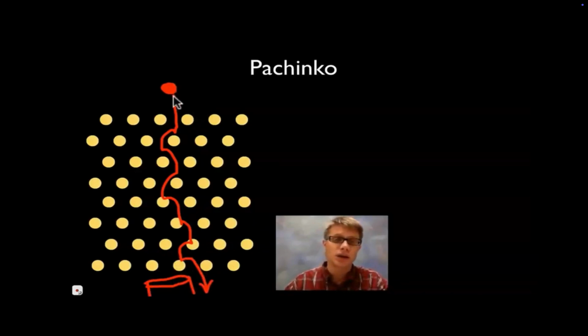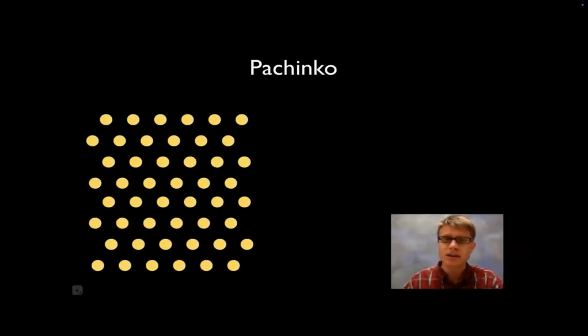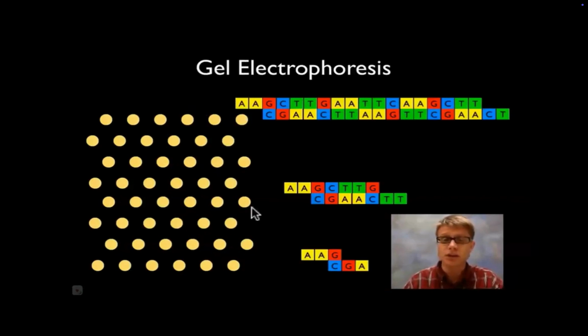But in that case, it wouldn't. So imagine a game of pachinko where we had one ball like this that's bouncing its way down. And then we had, instead of another ball, like 8 balls that are attached together. So what would happen to them if we dropped them in a pachinko machine? Does it make sense that they're sometimes going to go slower, they're going to wrap around, it's going to take them way longer to get down to the bottom. And so the single pachinko ball would already be at the bottom where this big chain of pachinko balls hasn't even made it very far. And so how does that apply in DNA? Well, think of DNA instead of pachinko. So basically, if we were to take a small fragment of DNA, it's going to work its way farther down through that pachinko machine sooner than one of these big fragments.